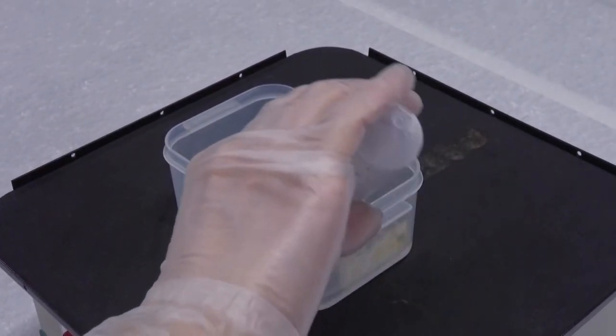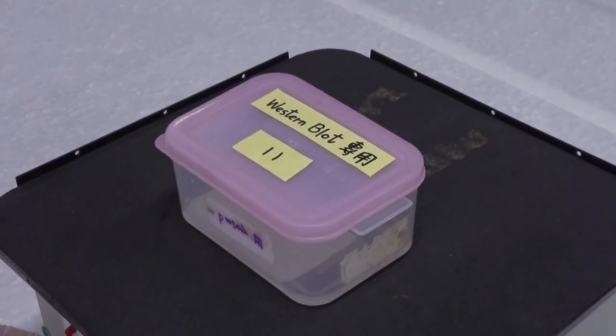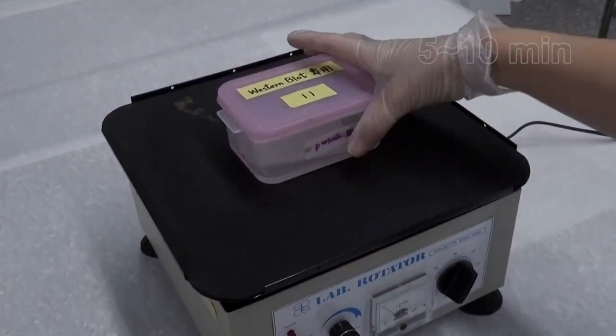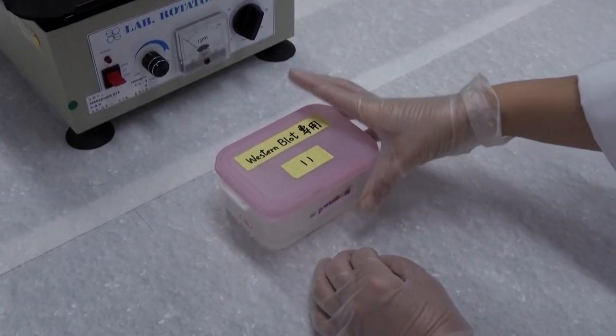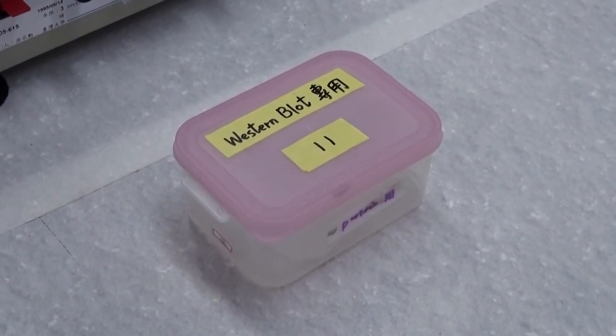Finally, add the storage solution PBS, put on the lid, and wash once with shaking for 5 to 10 minutes. Do not pour out the solution after shaking. The membrane may be kept in the solution temporarily and is ready for the detection reaction.